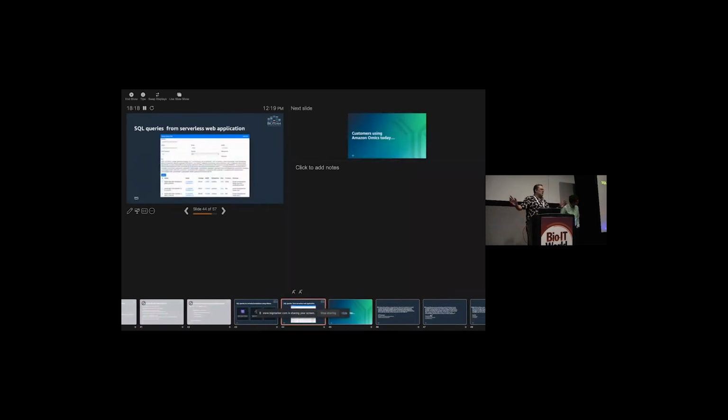This is so small I can't see without peeking around. But this is a static JavaScript website. Altogether, it's probably 50 lines of code. This is just a super, super simple app.